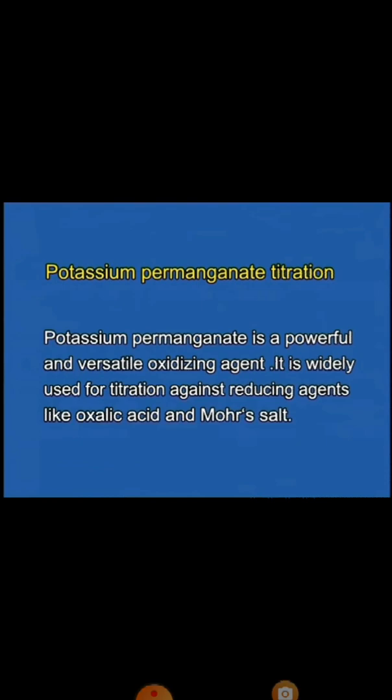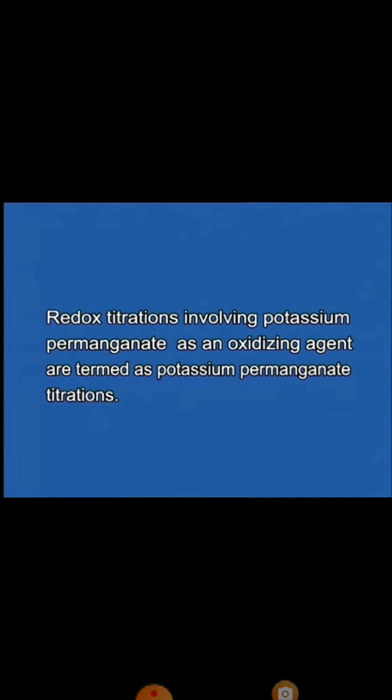It is widely used for titration against reducing agents like oxalic acid and Mohr's salt. Redox titrations involving potassium permanganate as an oxidizing agent are termed potassium permanganate titrations.